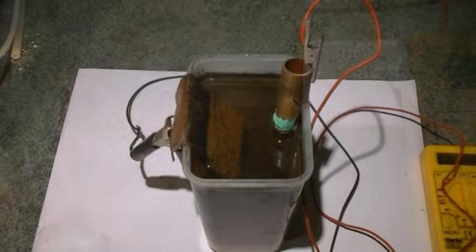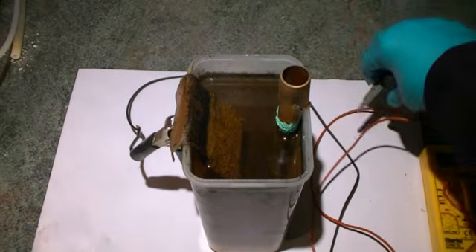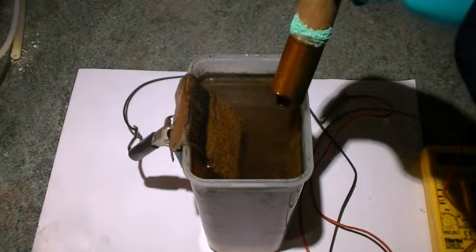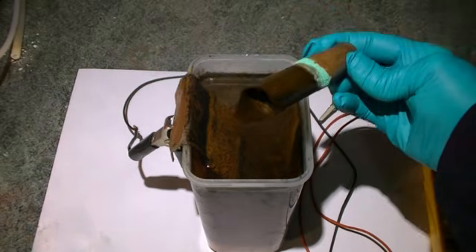And what we can see here is a reaction product forming on our copper anode and indeed consuming it and falling off towards the bottom of the container. We let our electrolysis cell run for 4 to 5 hours before switching it off and allowing the products to settle. On removing our copper anode, we can see quite clearly that some of it's been consumed in the process.